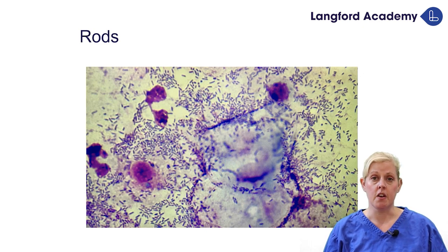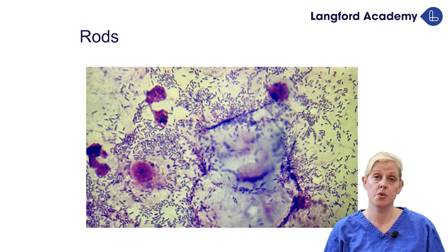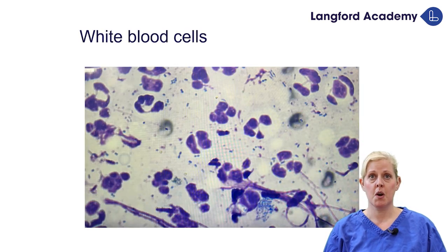These ears are usually very red, very sore, very swollen. It's not uncommon for us to see very active infections here on ears or on skin when we have the presence of rods. So here at the hospital, if we do find Pseudomonas, if we do find rods on cytology, we will always then deep clean that room. That consult room will always get a deep clean, and at the end of the shift, I will always set off a bomb.